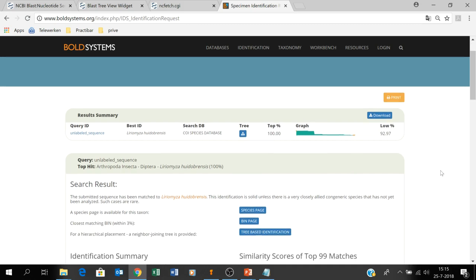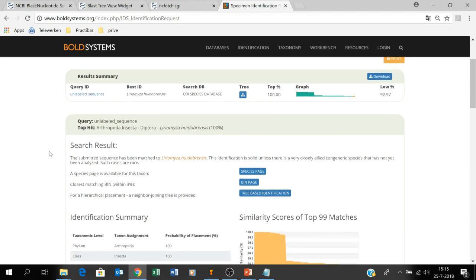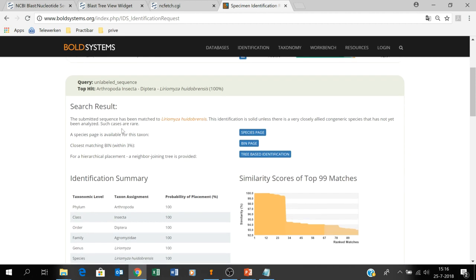The nice thing about BOLD is that it gives you, on top, the query sequence and your query ID, and here you get the best hit: Liriomyza huidobrensis. It also gives you a sentence: 'The submitted sequence has been matched to Liriomyza huidobrensis.' This identification is solid, unless there is a very closely allied congeneric species that has not yet been analyzed — but such cases are rare.